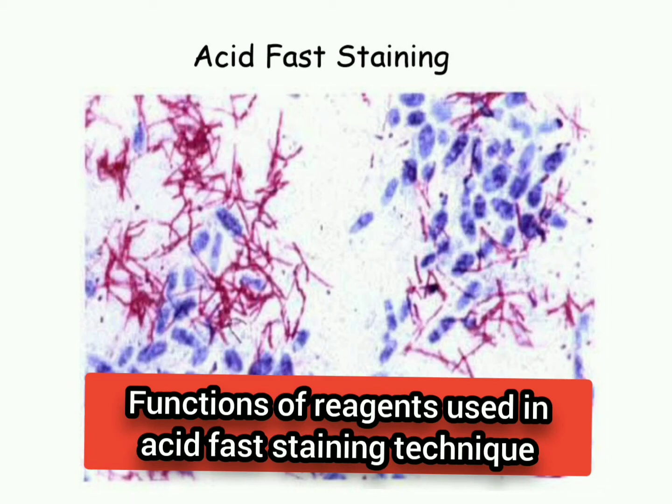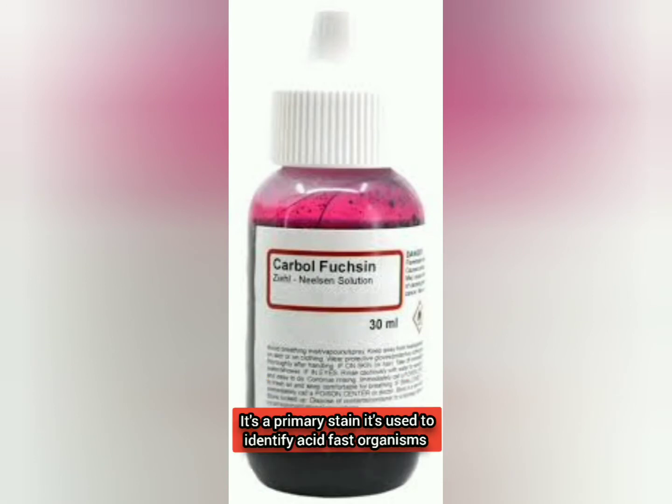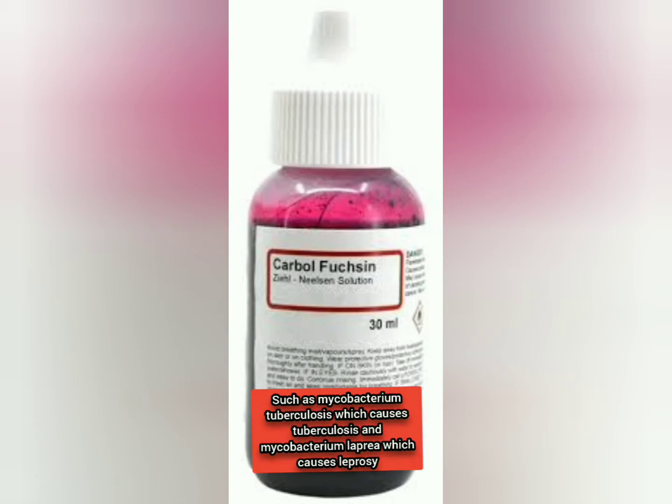Functions of reagents used in acid-fast staining technique. ZnCF stain, also abbreviated as Ziehl-Neelsen carbol fuchsin stain. It is a primary stain. It is used to identify acid-fast organisms such as Mycobacterium tuberculosis and Mycobacterium leprae, which causes leprosy.